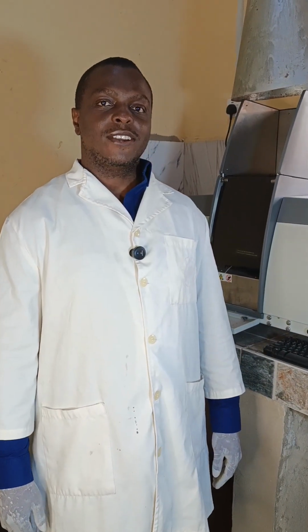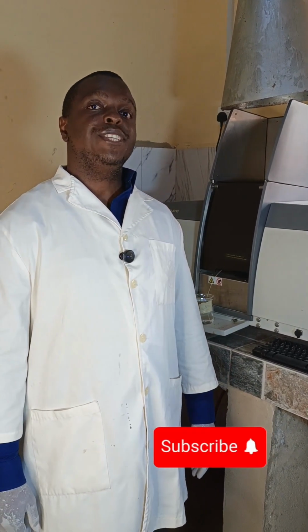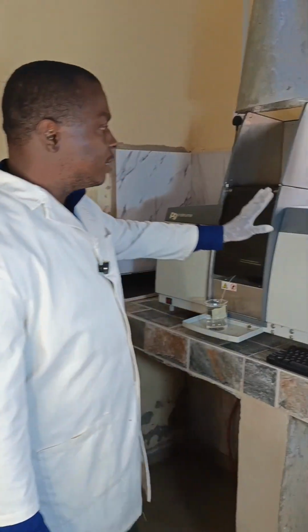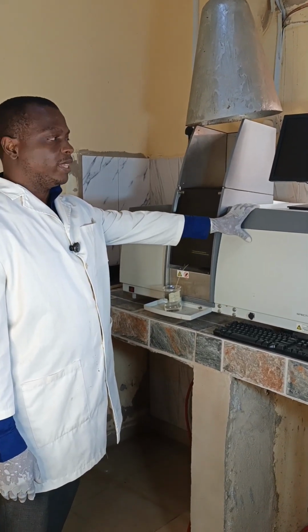Today we are going to discuss the operation of the Atomic Absorption Spectrophotometer by PG Instruments Limited, United Kingdom. As you can see, this is the PG AA500 Atomic Absorption Spectrophotometer.